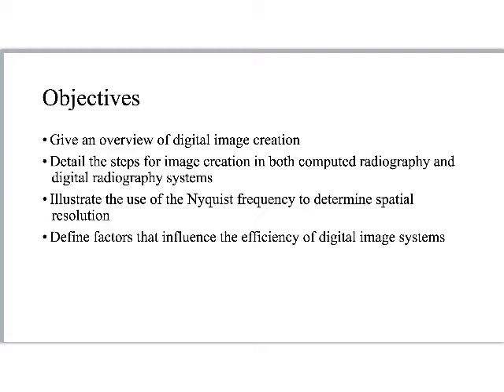Finally, we'll illustrate the use of the Nyquist theorem for determining spatial resolution, and we'll define some factors that influence the efficiency of digital imaging systems. That will be a place that you'll want to definitely pay attention.